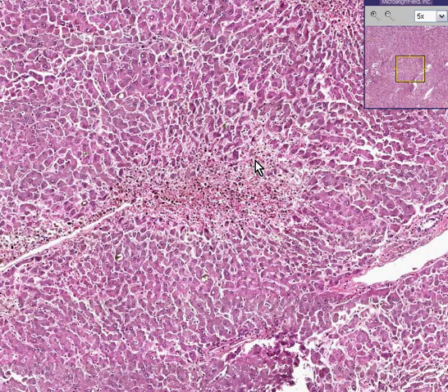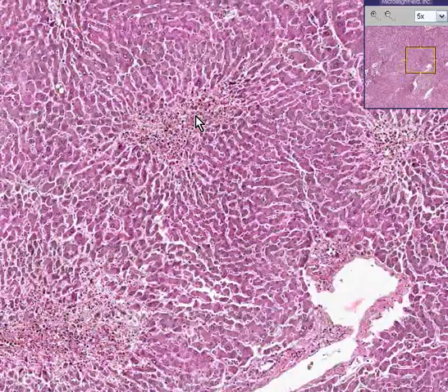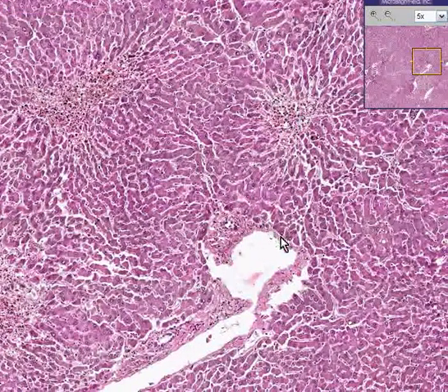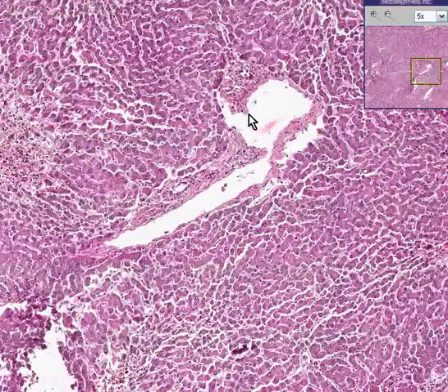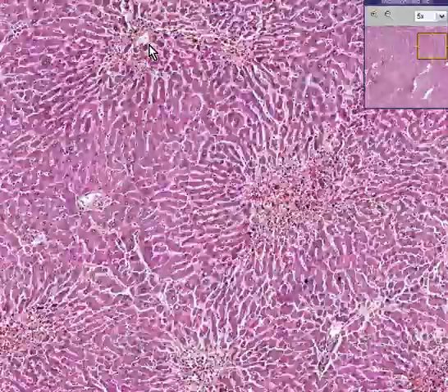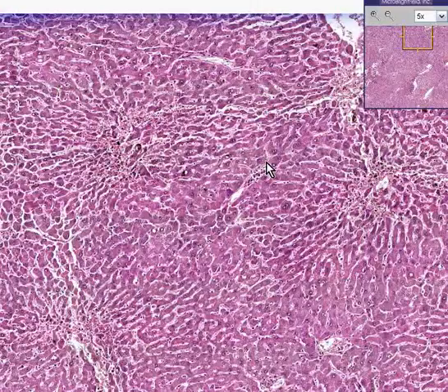Also note that you could see another necrotic lobule here. You could see another necrotic lobule here. You could probably recognize this is probably part of a portal area. But the thing that you should try to find in these, here's another centrally necrotic lobule. Let's try to find a portal vein area very nicely.